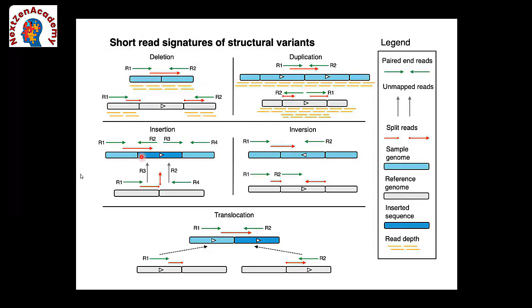So here you can see short read signatures of structural variants. This is deletion, duplication, insertion, inversion, translocation.